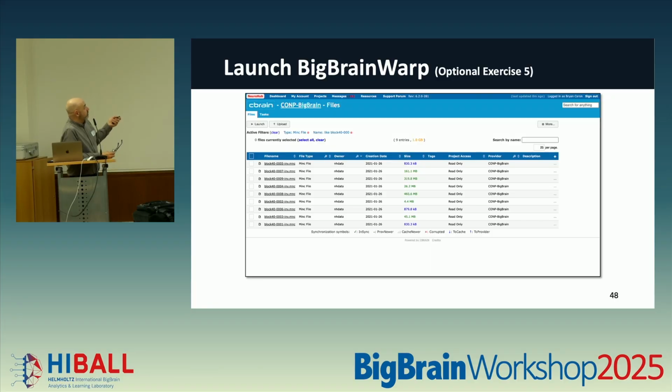So now with that particular filter, right, we have this set of 9 files, right? These are all Minc files. They're all part of the project. These are input files. So now you say, we're going to do the exact same thing, but we don't want to have to do this 9 different times, like what we did in the prior exercise, right? You want to do this once. But you want to do this in a way that's, again, reproducible for you later on.